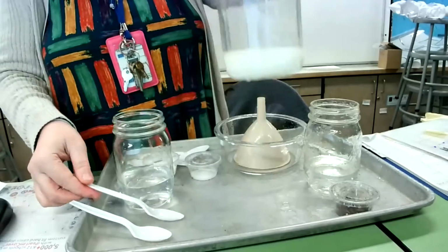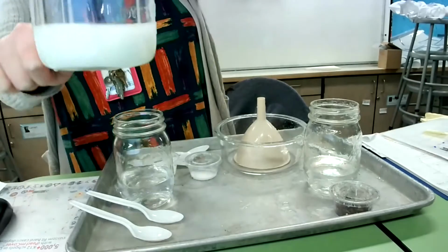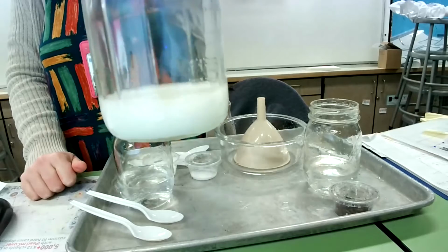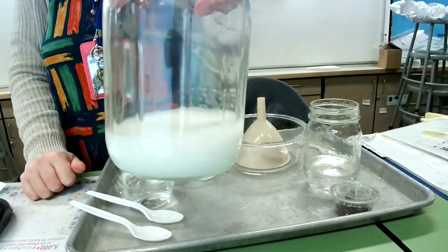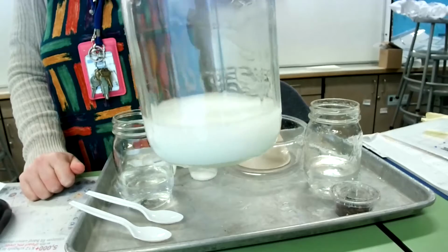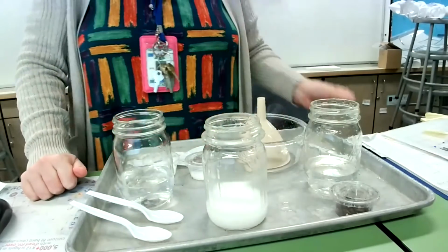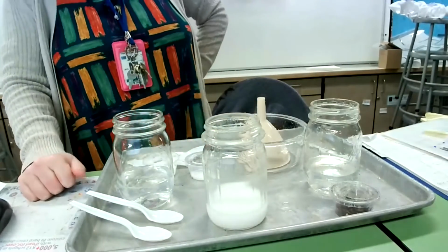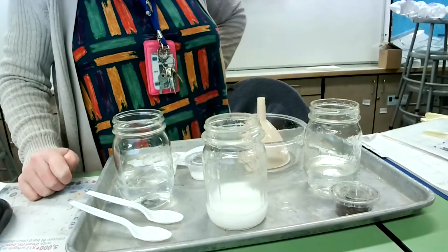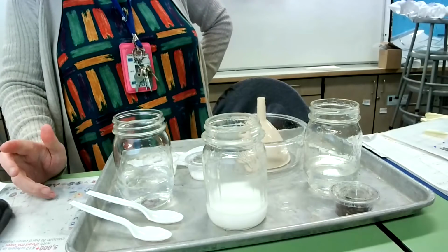So you can see that this is kind of murky, but it has a layer of clear on the top too. So I think if I continued mixing that, I might be able to get it all to dissolve, but it's more insoluble at this point than I would say soluble. Now, what I know about cornstarch is if I were to heat that up, cornstarch would all of a sudden disappear and you wouldn't be able to actually see it. It would be a clear liquid.